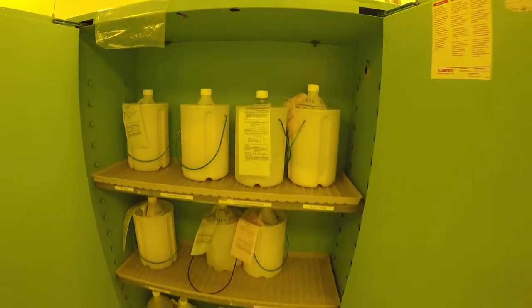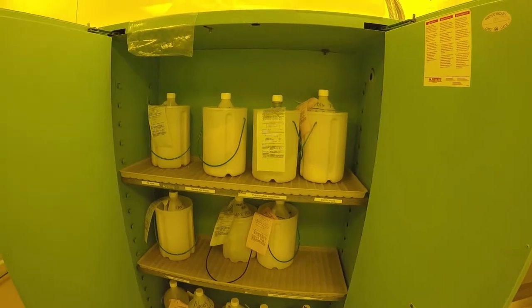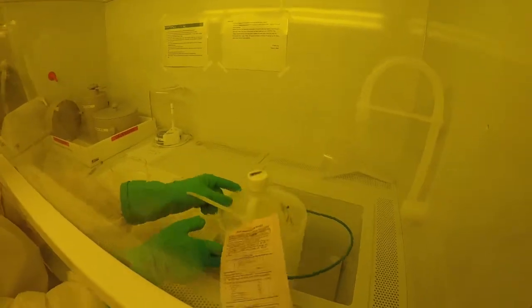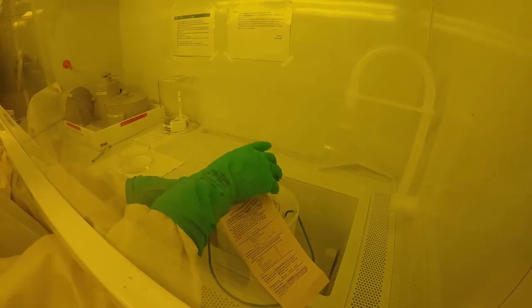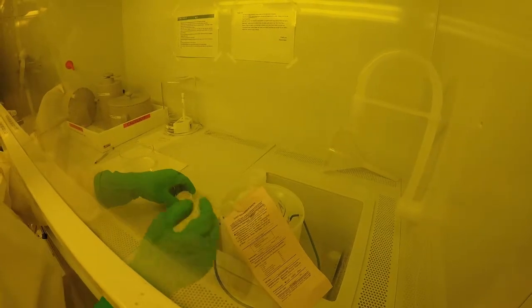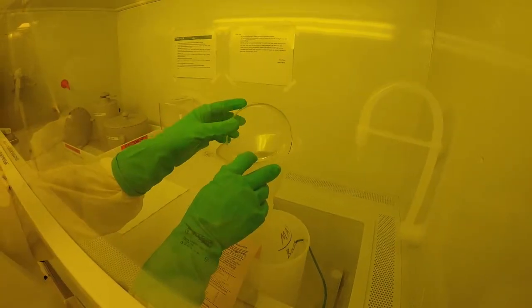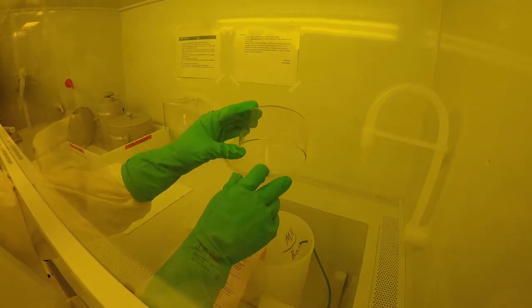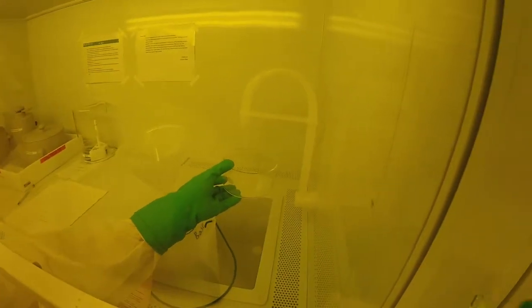All waste bottles must have secondary containers and vented caps to prevent over-pressurization. Take the waste bottle to the fume hood. The waste bottle must always stay in its secondary container. Set the waste bottle and secondary container in the sink and use the funnel to prevent spills. Pour your chemical slowly, taking care to note if any chemical reaction takes place. If you notice a chemical reaction, for example fuming or bubbling, place the bottle to the back of the hood and close the hood.